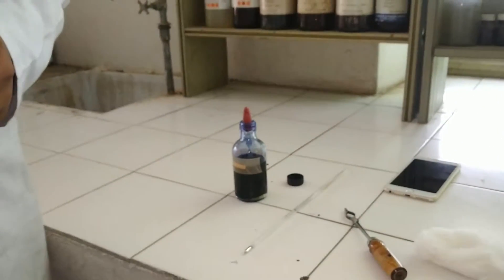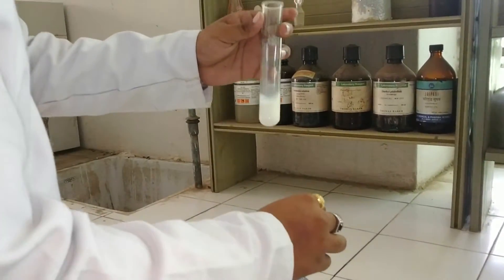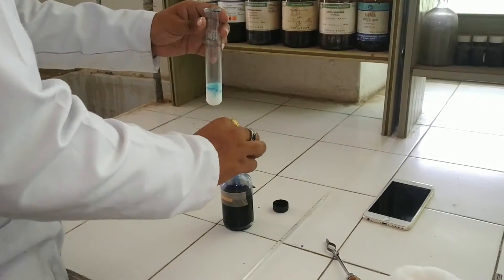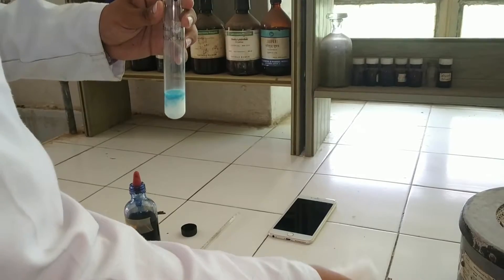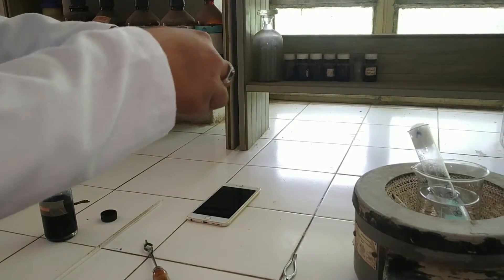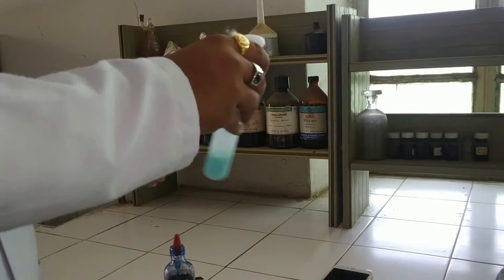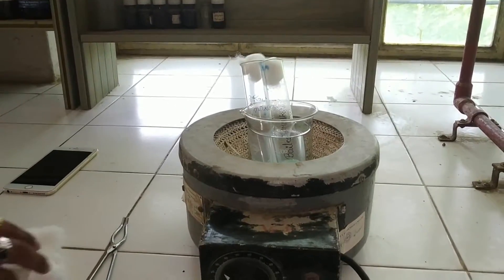Then take another sample, that is raw milk. Add 2 to 3 drops of methylene blue and repeat the procedure same as above. Add a cotton stopper, close the lid, and mix it. Then add it again to the water bath which is maintained at 37 degrees.